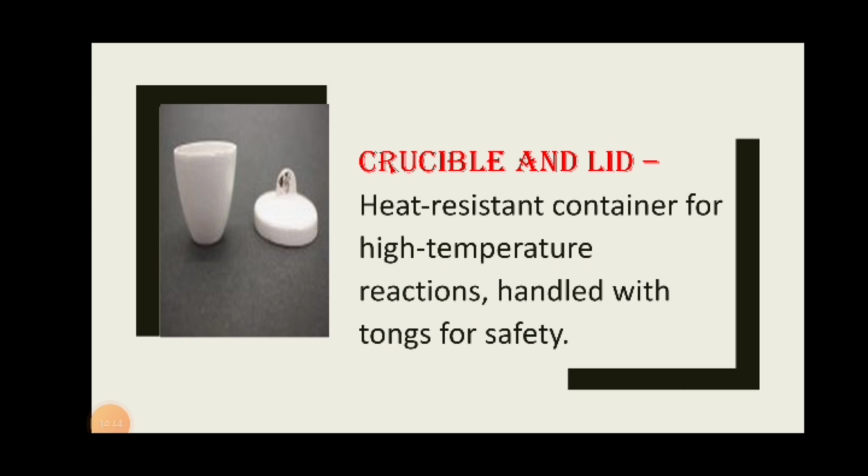So, hindi siya ma-broken down kasi nga maka-withstand siya into high temperature. Kaya niya yan. Unless lang kung if you have some other intervention from very high temperature, kunin mo doon, lagay mo sa very cold, it will break down, no? But normally, kaya niyang i-withstand ang temperature na hindi siya mag-break down, hindi siya mag-cleave.